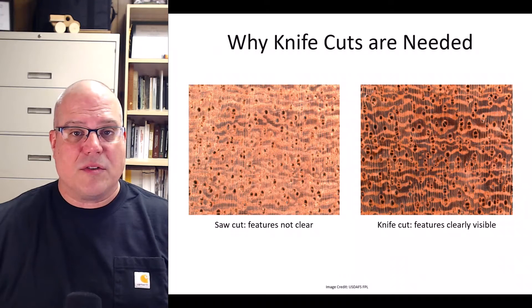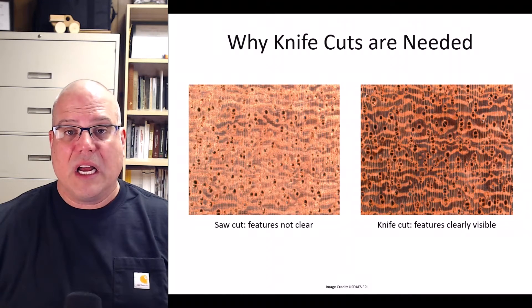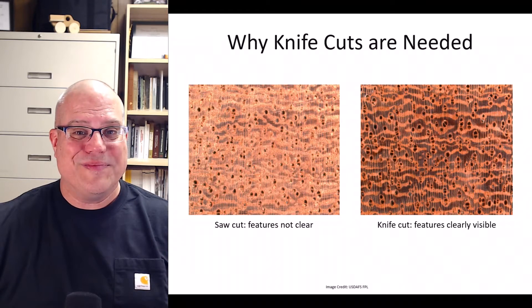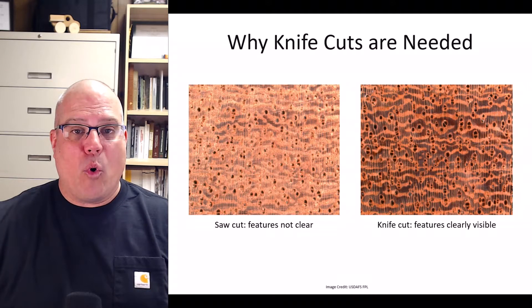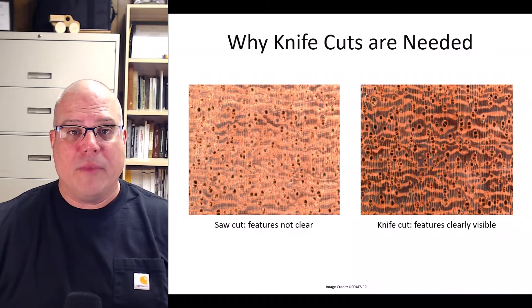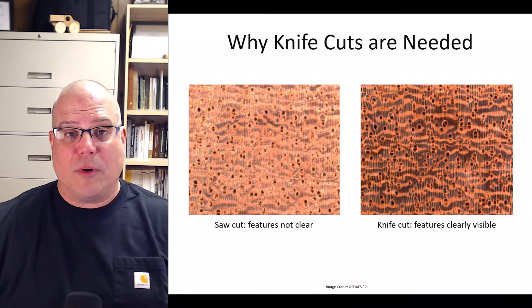The picture on the right is the transverse surface of the same wood cut cleanly with a utility knife — much better. Now I can see the pores and rays, those thin vertical lines, very clearly. I can also see the areas of light-colored tissue called parenchyma, which were completely invisible in the saw cut image. We'll talk about parenchyma in a later video, but suffice it to say they're very important features for wood identification.